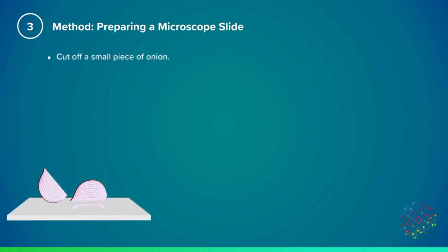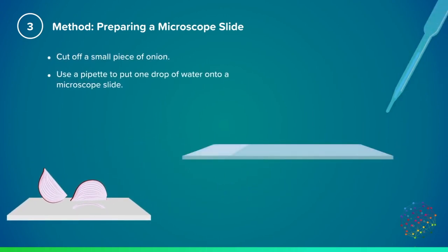Place this to one side and take your microscope slide, holding it via the side so that you don't get your fingerprints on the flat surface. Use a pipette to put one drop of water onto the microscope slide. This will help hold your onion on the slide.